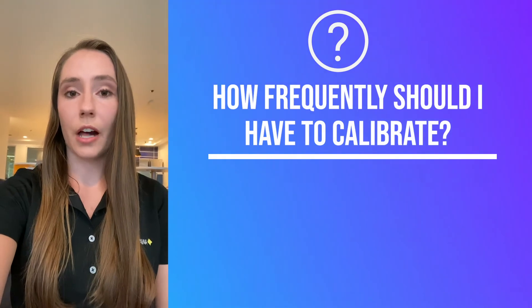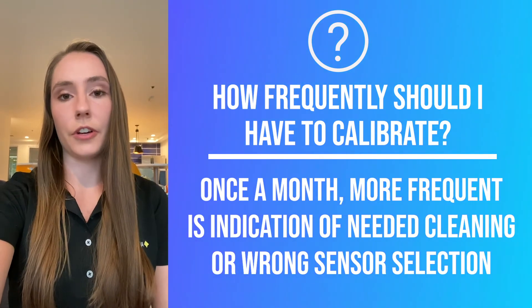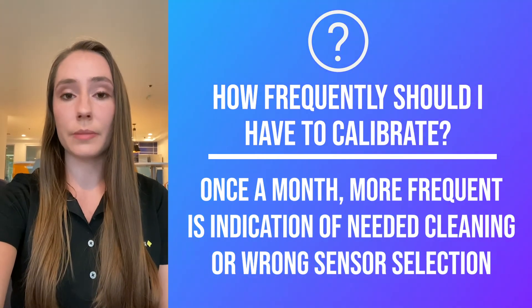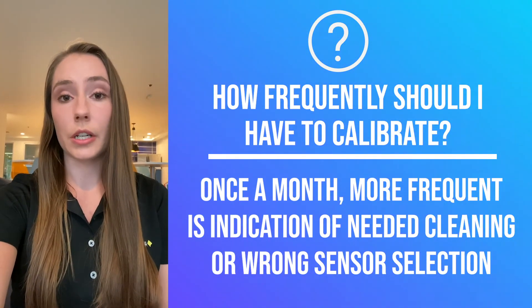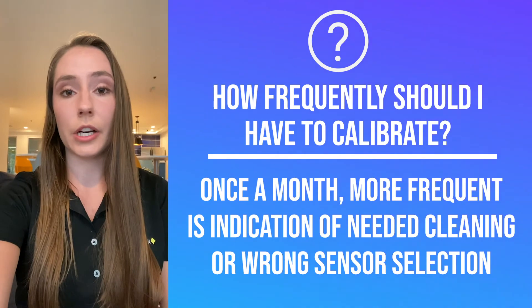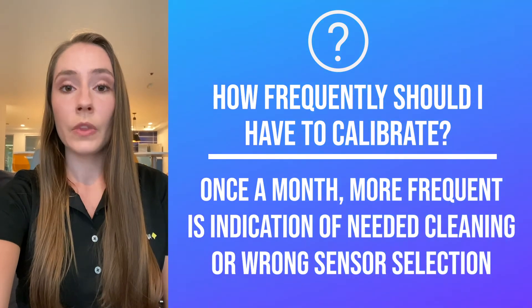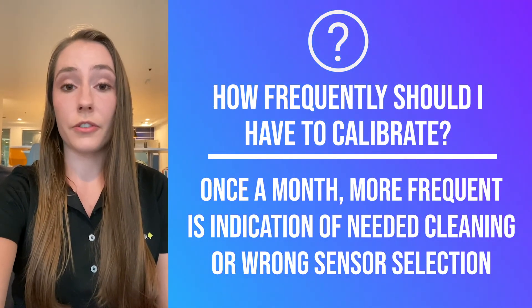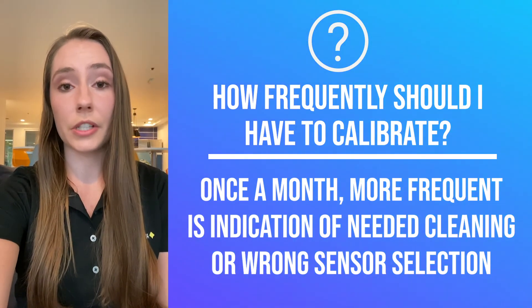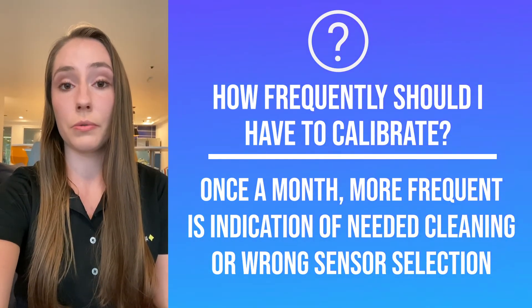Keep in mind that you shouldn't have to calibrate your analyzer too frequently. The ideal time between calibrations is about a month, so if you're noticing that you have to calibrate much more frequently than that, it could be one of two things. The first is that you might just need to clean your sensor more frequently — we have several options for automating that process, so feel free to reach out to us. The second is that you could have the wrong reference sensor for your specific application, in which case we'd be happy to evaluate your application and give you a recommendation for a new reference system.